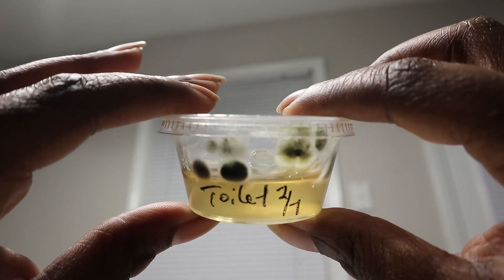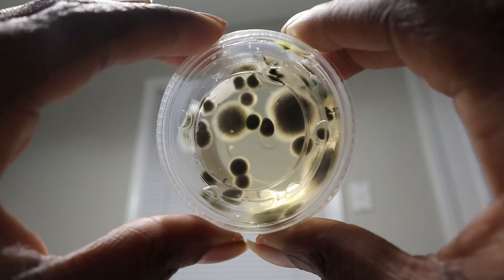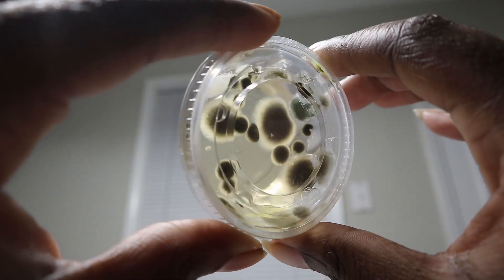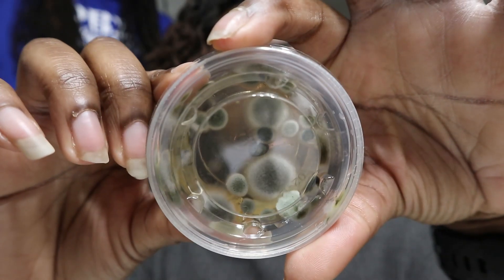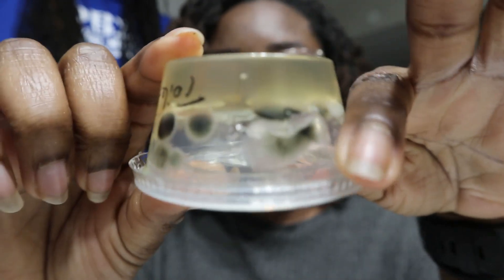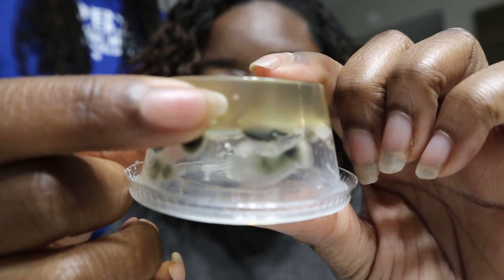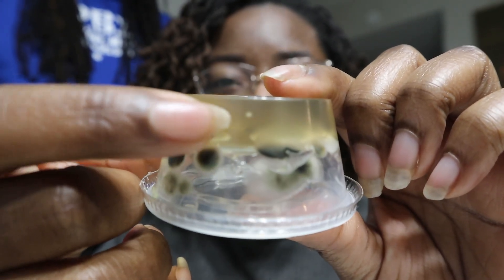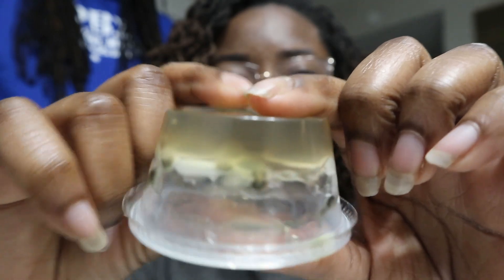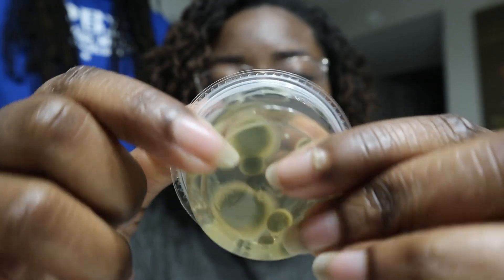The last one I'll talk about is the toilet. I lifted up the toilet seat and swabbed under the rim. This one has a lot of growth — very, very distinct colonies — and it also had growth throughout the agar. If you see this little white dot, that is a colony inside of the agar. It's really interesting.